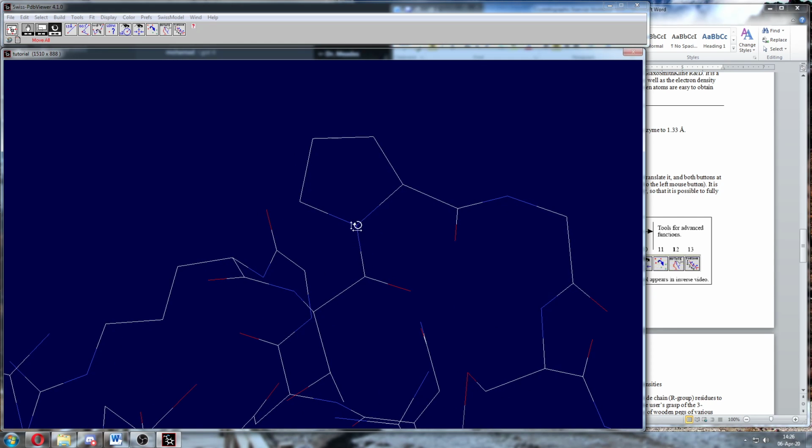So this is the amino nitrogen, the alpha carbon, and this is the carbonyl. You'll also notice that this is shown as a carbon to oxygen bond, not a double bond. So no double bonds are shown as double. They're just connections. That's all these lines are. All the lines are bonds, but they're showing connections, not necessarily double or triple bonds. But this is definitely proline because there's the propyl group that wraps around and binds to its own nitrogen.